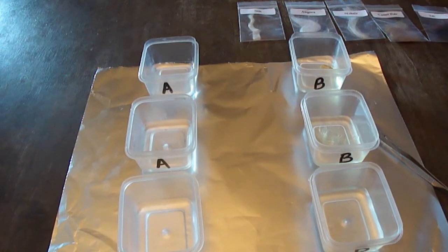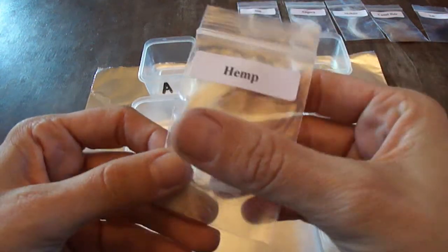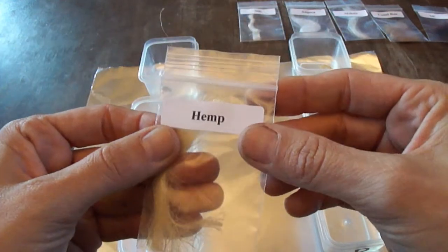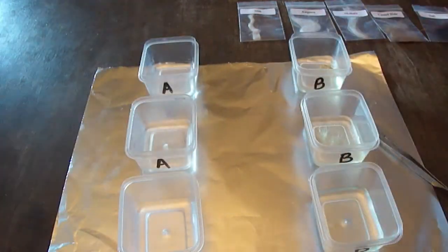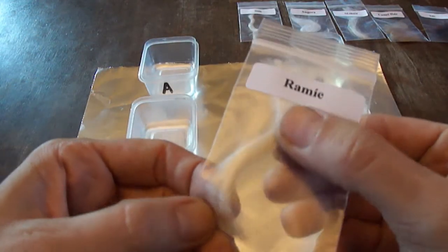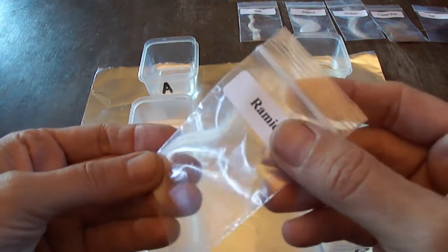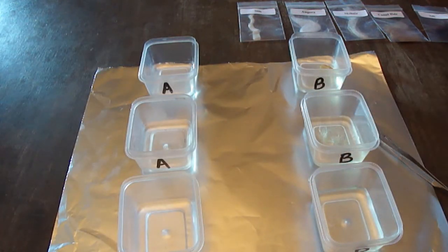I've also got some hemp — not doing an experiment on it but it's really similar to flax. Hemp fiber looks very similar, it's a rough texture like rope. And this is ramie — it's similar but a little silkier, a little softer, a little more lustrous naturally. So those are our natural cellulosic fibers.